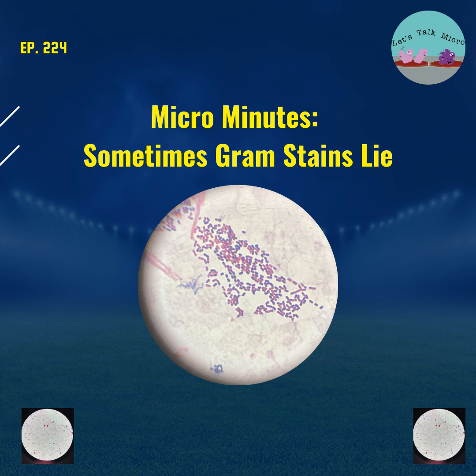Because when you have a true gram negative cocci, you don't have a rod shaped organism in there. If you have a Neisseria gonorrhea or a Moraxella catarrhalis, let's say, what you see is gram negative cocci. So scan the slide, you see maybe some tiny gram negative rods, then you have a rod and not a cocci.